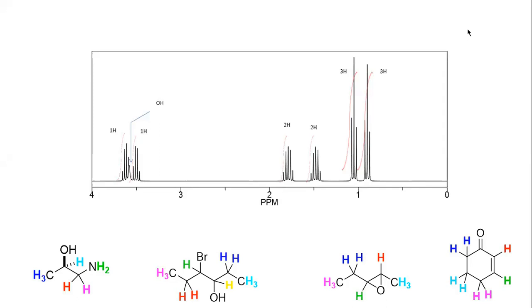You need to consider their chemical shifts to determine where they are. The chemical shifts. Yeah, very important. I agree with that. And so we know that these two structures are out, right? Right. We know that these two structures are out. So you need to consider the chemical shift. What else do we need to consider?